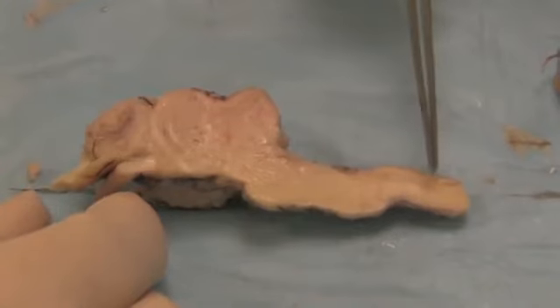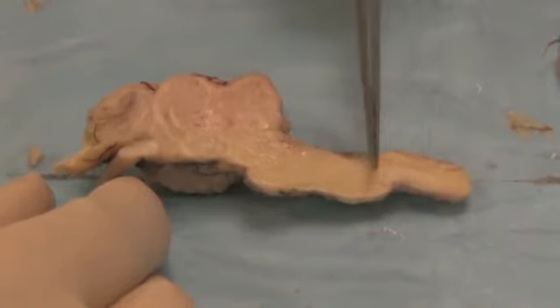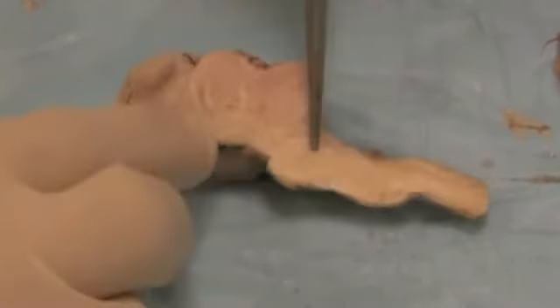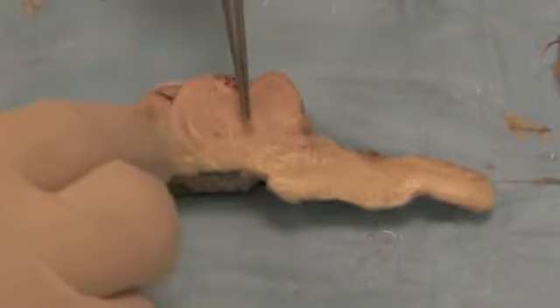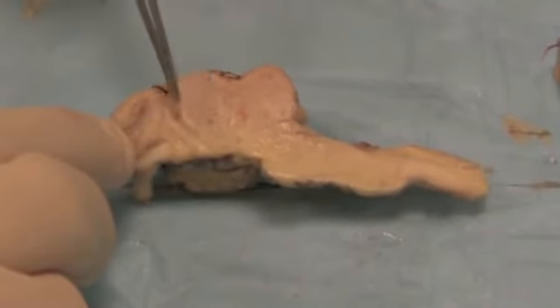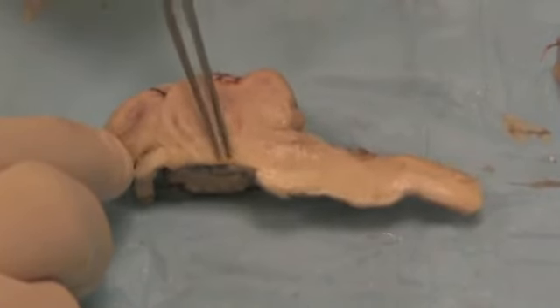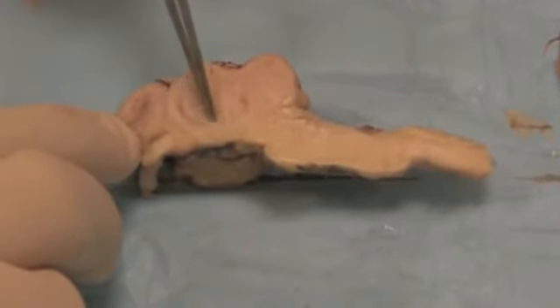Now we're left with the spinal cord, the brain stem — medulla, pons — and you can see how the pons connects into the cerebellum. Medulla, pons, and midbrain, and also the thalamus. We can see very clearly the different areas of the thalamus and the neurons that run through the thalamus into the cortex and out from the cortex. Underneath the thalamus we have the hypothalamus — hypo means underneath.